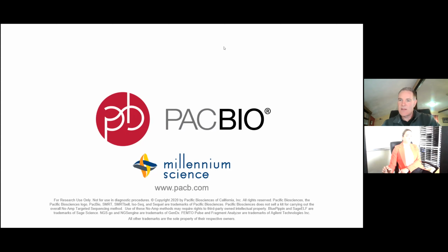Are shorter HiFi reads just as accurate? Yeah, that's a good thought, isn't it? Yes, in terms of their Q scores, they are absolutely as accurate. In fact, you could argue that because you've sequenced around the molecule more and more times, depending on your movie length, they could actually be more accurate, but you're losing some power in their mappability because of the length of the reads. So ideally, you do need longer reads than just say 5 kb in this example in the chat. So I think that's the answer I'd give you for that, Joseph. Yes, they're just as accurate, but you lose some power in terms of the read length. Longer reads are very helpful, and certainly we'll talk in 2 weeks' time about sequencing whole genome plants and animals. You need ideally some really long reads to help get context together. So it's not just about the accuracy of the sequencing itself.